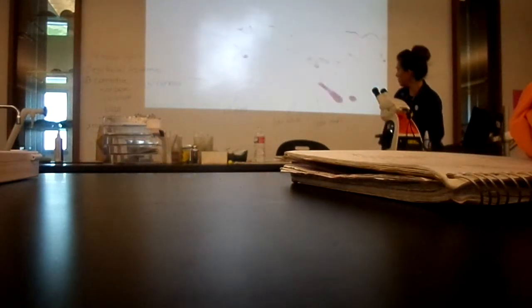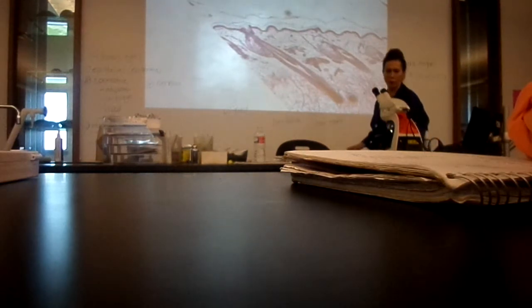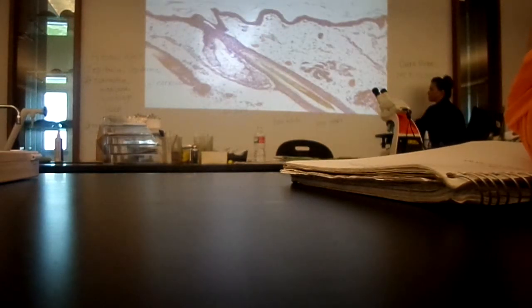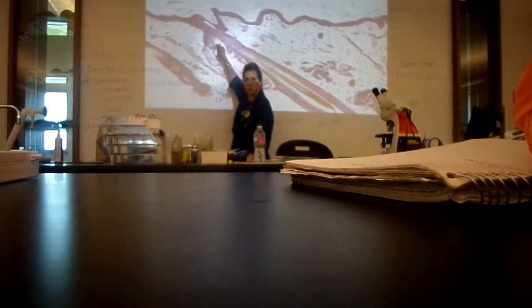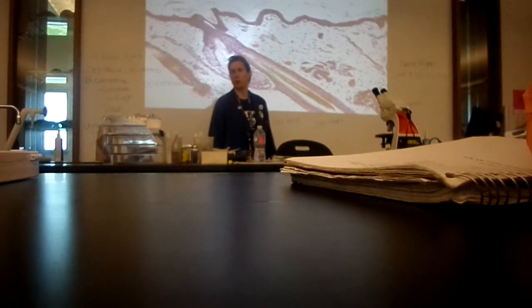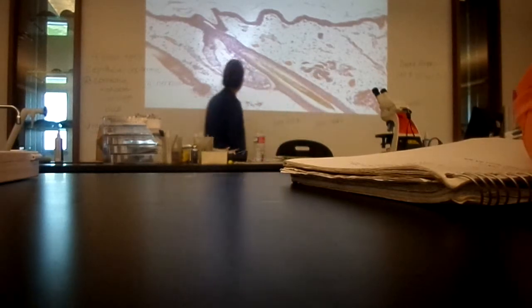If you go out onto a lower magnification, there are more of these. These two things right here are sweat glands. Oil glands open into the hair follicles. Sweat glands don't. They just open right up on the skin's surface. Both of these are sweat glands.